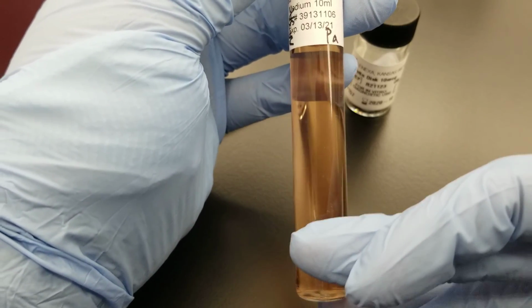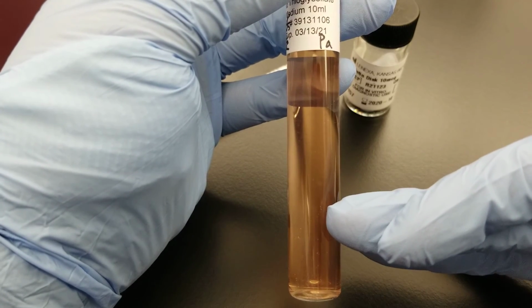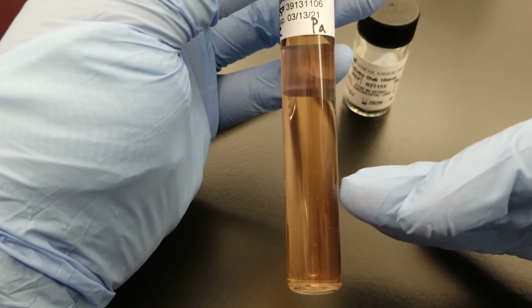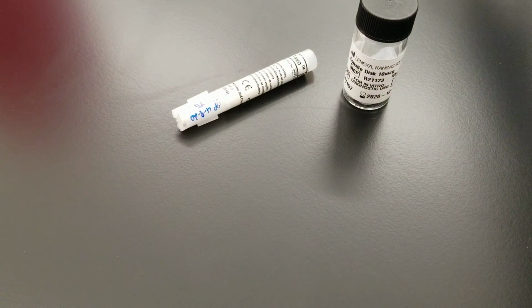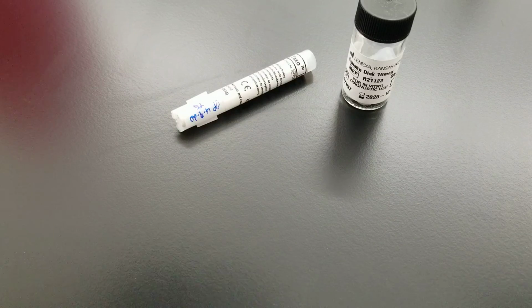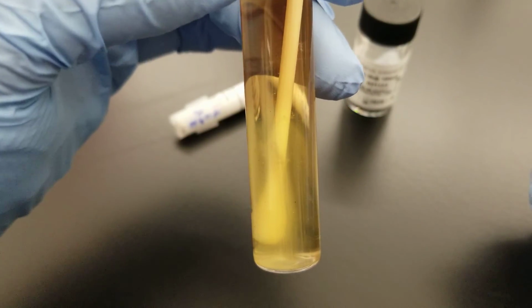And you would definitely look at this every day for those 7 days after you started incubating it, in order to figure out if there's any organism there. And you can gram stain it and see if it matches what you've had previously with your initial primary setup gram stain. So here, this is an indication of growth.